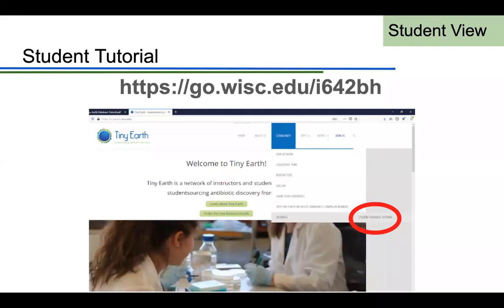Before we get started, I wanted to let everyone know that there's a full tutorial in PDF form on the student side of the Tiny Earth database, and anyone can access this, students or instructors or the public. You can access it via the link at the top of this page, or from the Tiny Earth website under the Community tab and clicking on Database, and then you'll see Student Database Tutorial. We'll be going over a majority of the student side of the database here, but this resource is available to you at any time as well.